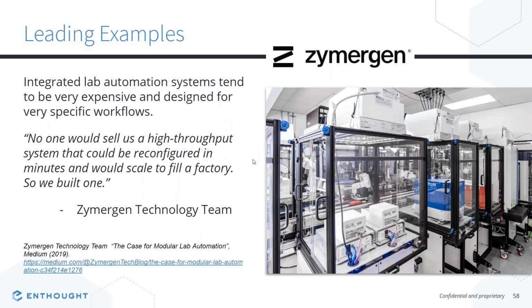An alternative example of another lab doing really cool things is a company called Zymergen, an upstart company that recently went public. With major investor backing, they've built digital-centric labs from the ground up. As a startup company, they've been able to quickly go down this digital route, and they've been able to largely avoid the organizational and cultural change challenges that are faced by large incumbent companies in the industry.